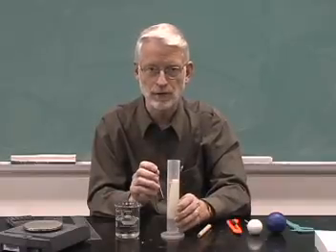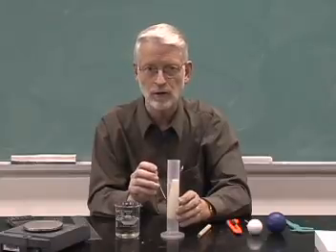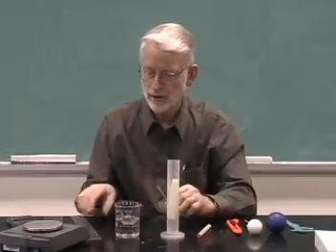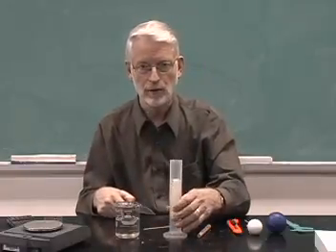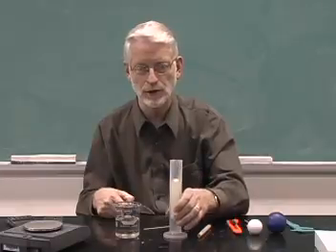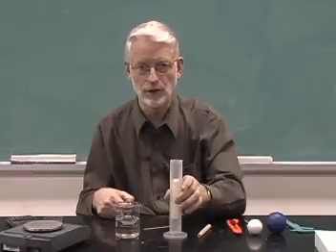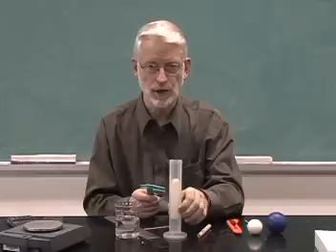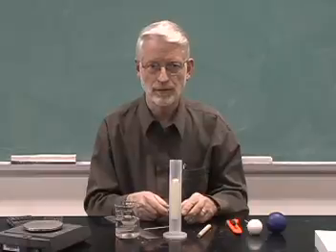Now you'll find often that the volumes may differ by a few milliliters, and that's due to what we call experimental error, because every measurement has associated with it an error. Students may read the scale a little bit incorrectly. They may make a mistake in reading the volume, or are not able to read it very precisely. And so with experience, that experimental error will decrease. And so it's good practice for students to use both techniques, measuring the volume by displacement and calculating the volume using a ruler and the appropriate formula.